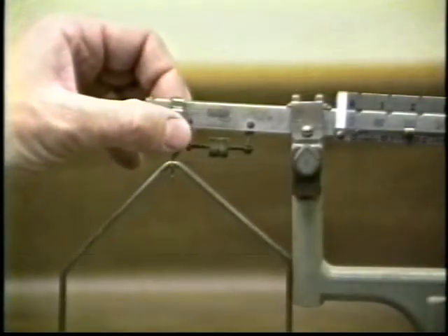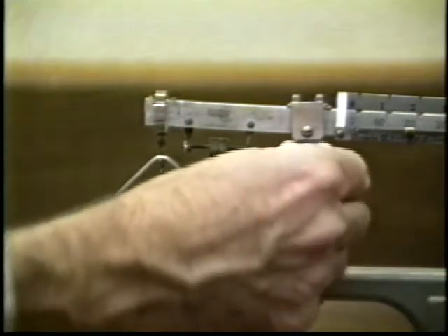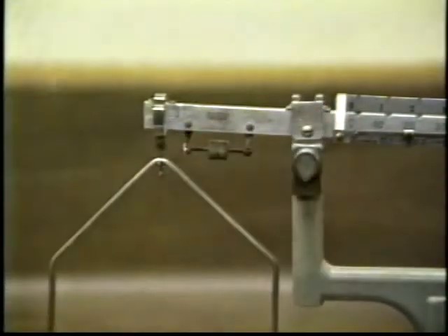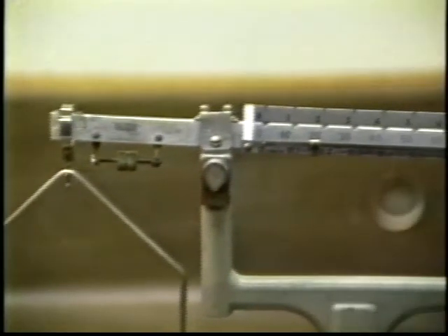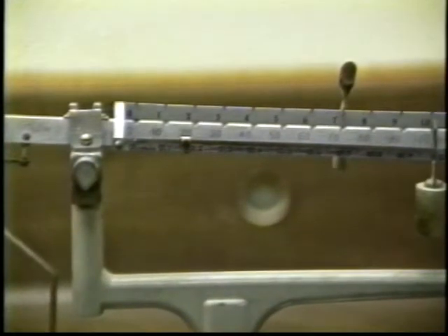Hang the upper end of the pan support on its knife edge. Unlock the pivot lock by turning it 180 degrees so that the more pointed part of the lock is down. This unlocks the balance, allowing it to be used. It is very important to unlock the beam — if the beam is locked, the balance will appear to function but will give completely erroneous results.